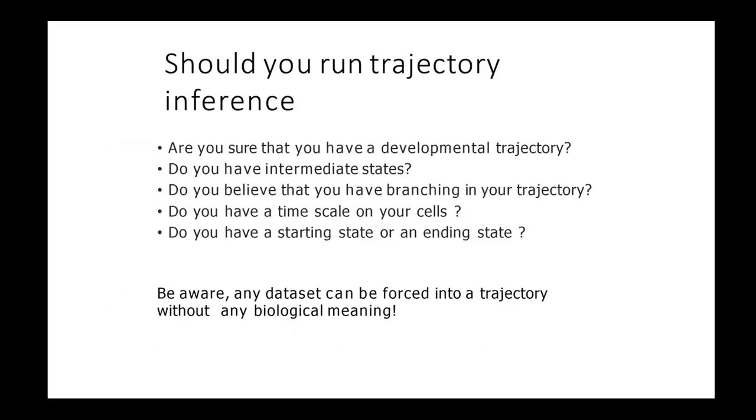Yes. So the big question that I would like you to ask yourself is, should you run a trajectory analysis? Does it make sense in my data? I always make the analogy of my son, who draws very well now, but he could draw a trajectory through your cells. This doesn't mean that this is meaningful and really relevant. So be aware that you can always force cells to go along a trajectory, so always be forced to be along a pseudo-time axis. But this doesn't mean that this pseudo-time axis reveals something biologically meaningful. And so therefore, I would love you to first ask yourself those questions.